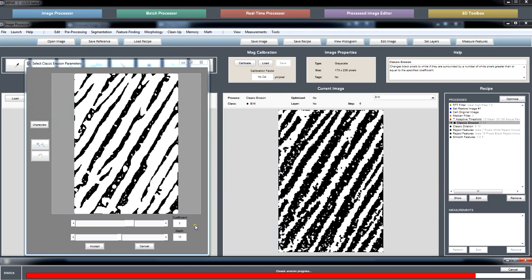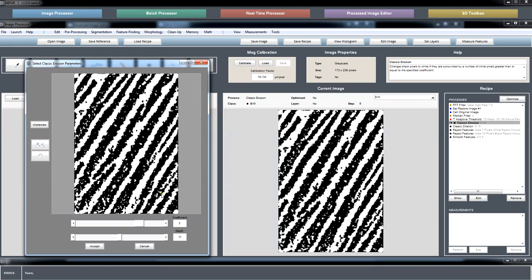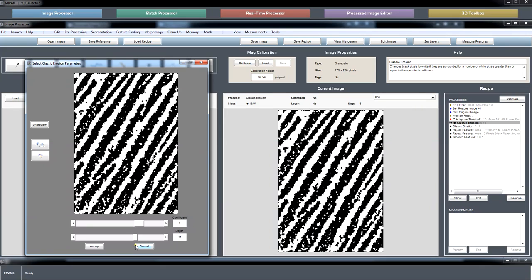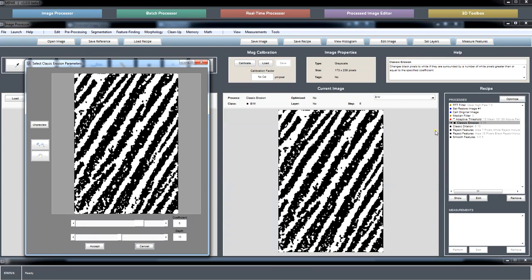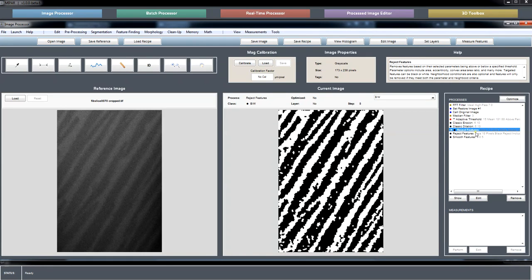So 5 or 6 is usually what we choose for a classic erosion, 6 if you want less aggressive behavior. And usually this depth saturates at about 10. With more iterations, you've already exhausted all of the black pixels that need to be switched, so nothing much more is going to happen after 10. Dilation, we then go in the other direction. That fills in some of the white noise. And then we have a small white artifact rejection step and a black artifact step, and finally a smoothing step.